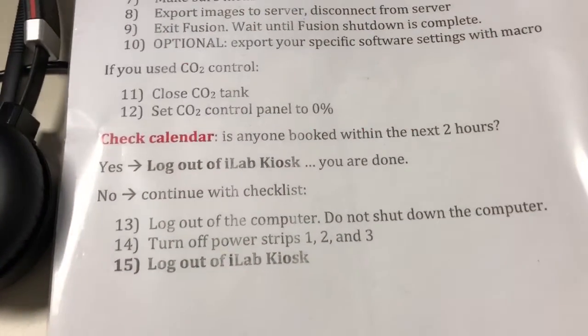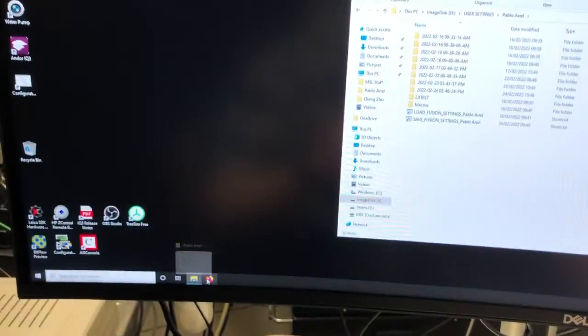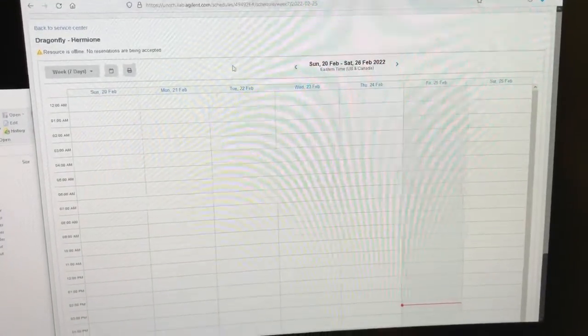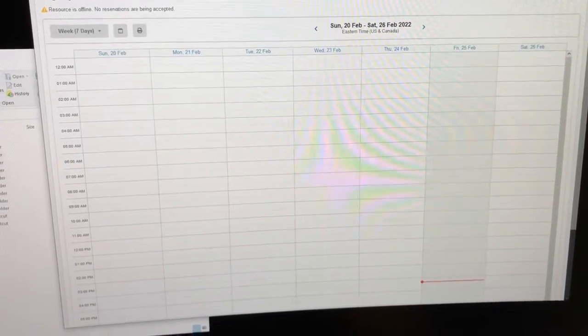You will then check the calendar to see if anyone has booked within the next two hours. To check the calendar, go to Firefox which will default to the Dragonfly calendar, and you can check here if there's anyone after you.